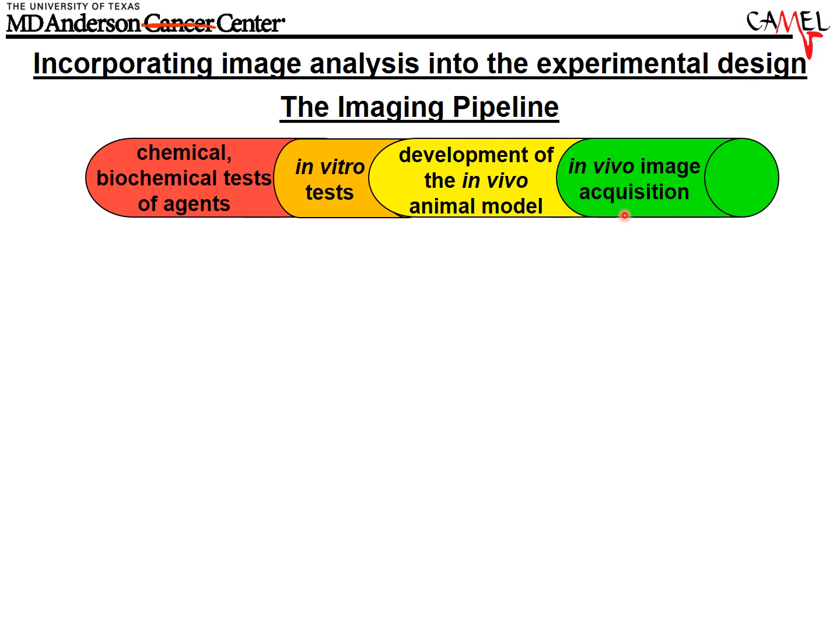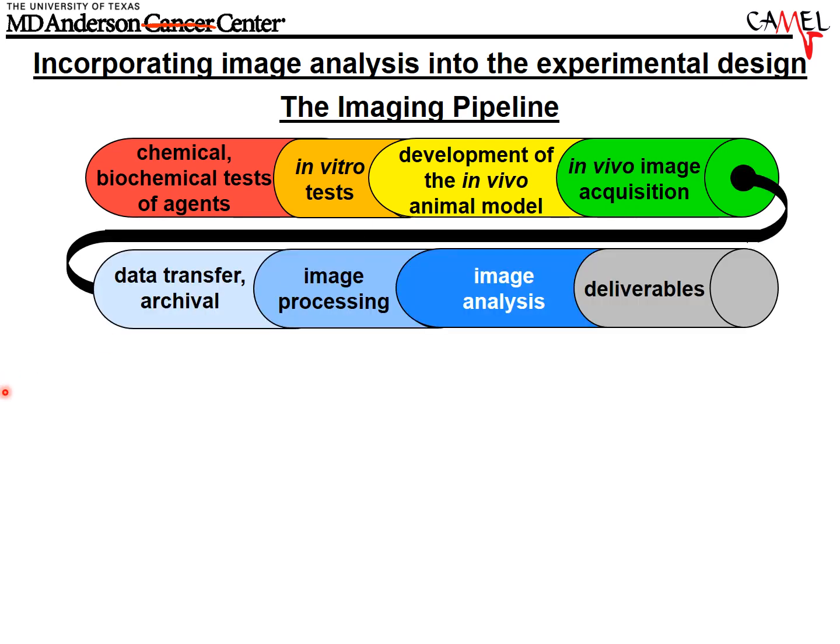And then the analysis part, well, that's pretty easy. Someone will do that work, right? And you've heard that story before. Somebody magically will do the analysis. Well, if you think about it, the analysis involves this data transfer, which is sometimes not trivial. Also archival, making sure you can go back to the data when you need it, is non-trivial.